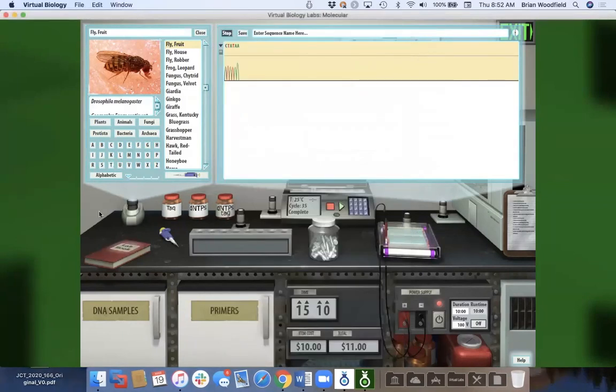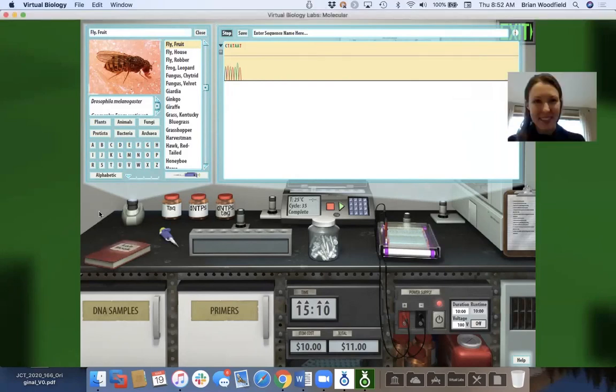Again, the lab is the lab. It's what you do with it as the instructor. So we wrote some content that could be drop-in, and you really don't have to do anything except, here, go do this worksheet. Here are the instructions. Students go do it. That's generally how it works, and it works really well. But you can modify it. You can add your own content, and you're certainly welcome to modify what we've provided for you. Can you show genetics?